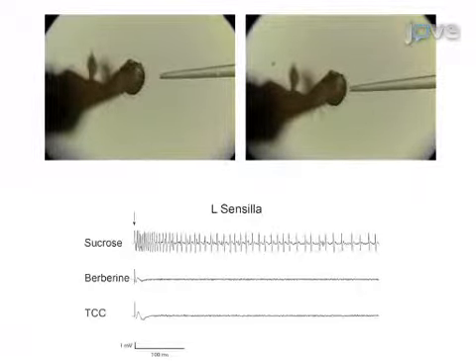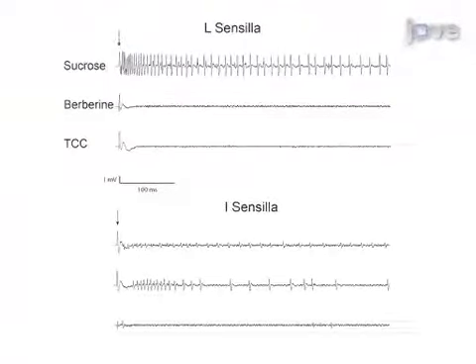Next, an individual sensillum is stimulated with a taste compound while the neuronal response is simultaneously recorded. Ultimately, electrophysiological tip recording from individual labellar sensilla is used to show the responses of taste sensilla to different taste compounds. Visual demonstration of this method is critical as the fly preparation steps can be technically challenging and difficult to learn.